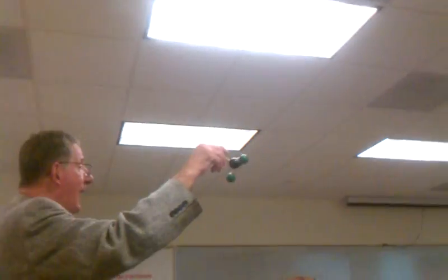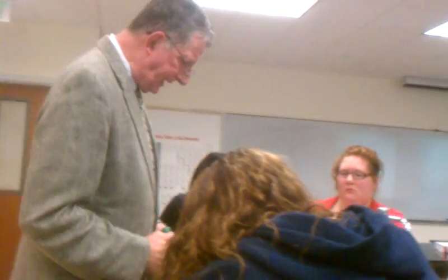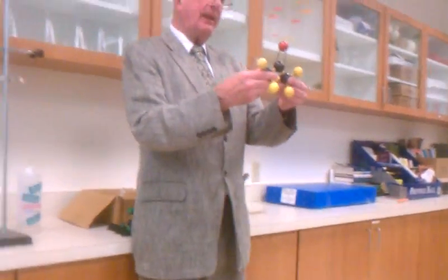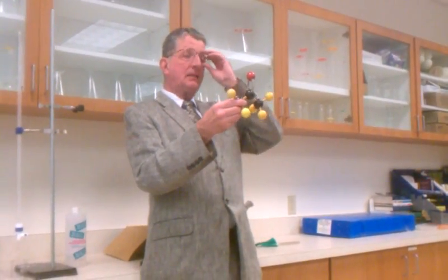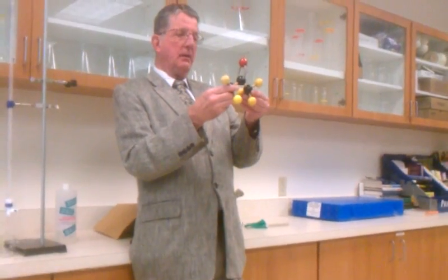This is from the chapter we talked about. Remember we talked about structure and polarity? So this is right from there. And so that one doesn't divert, isn't attracted to the rod at all. And now it turns out, what did I say about acetone? This is acetone. It's polar, but it's not as polar as water.